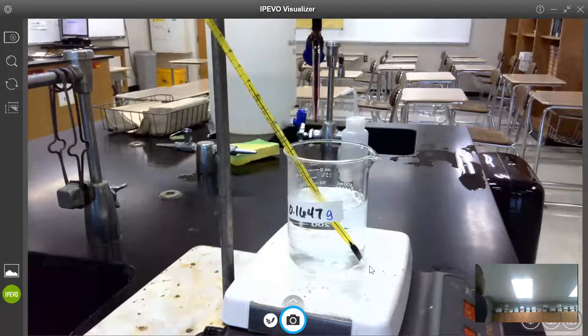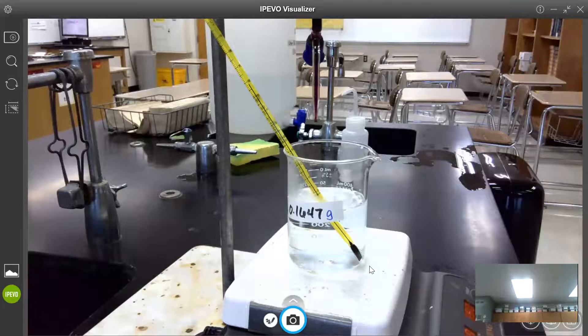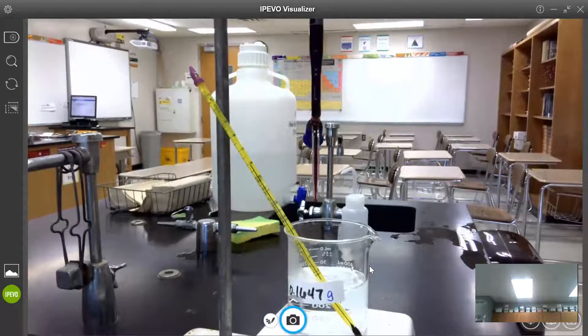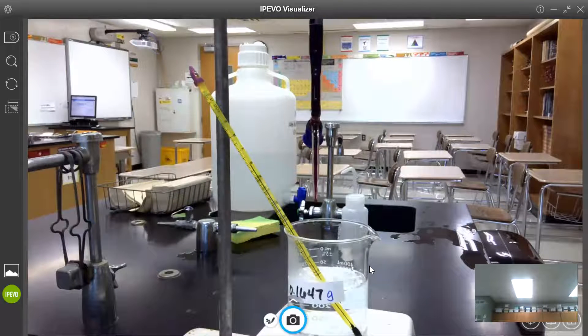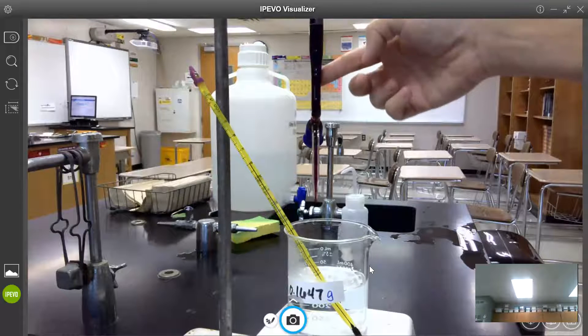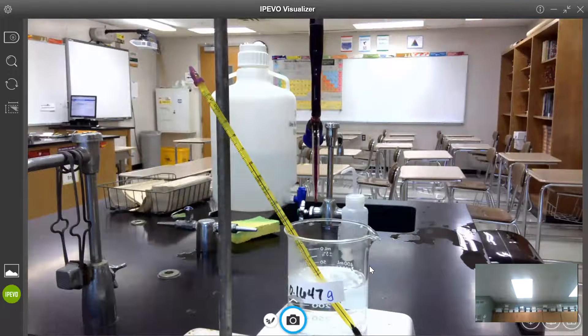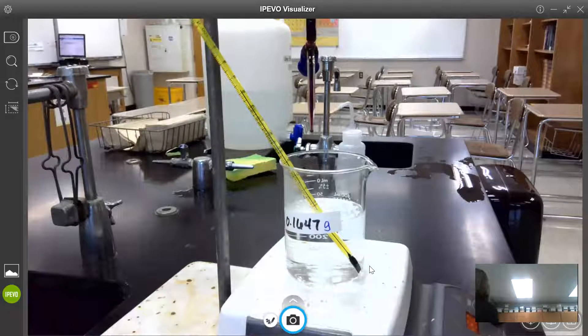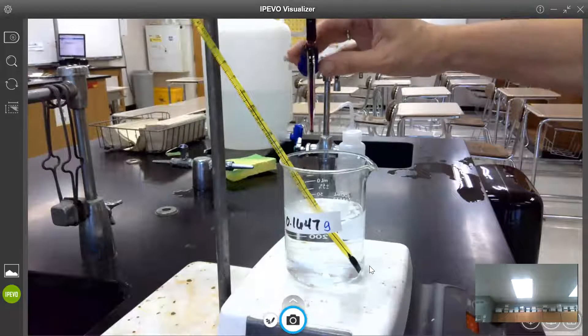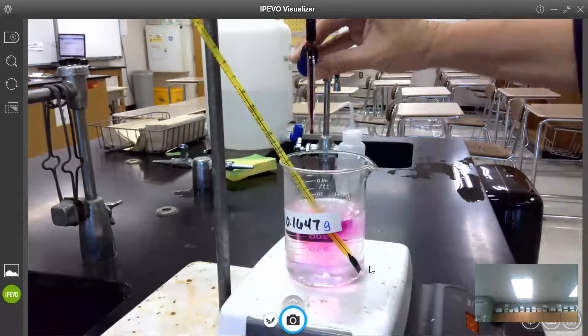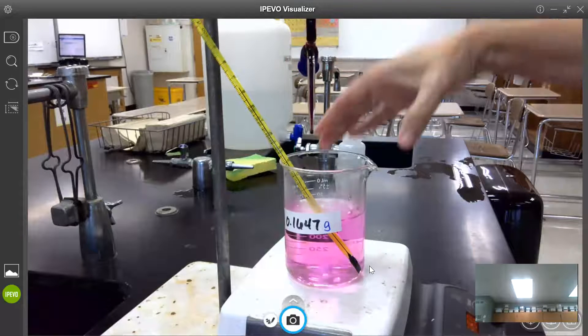I'm not sure how clearly you can see the contents of our burette but you can see there that's very dark purple in color. Dark purple and we have a colorless solution here in the beaker. And so when I start adding the KMnO4 I'll just add a little bit right now. You can see that burst of pink color.